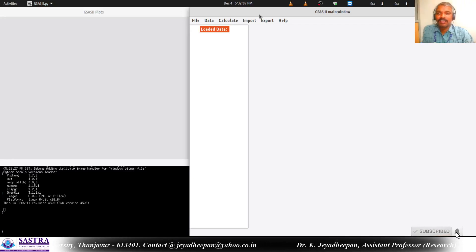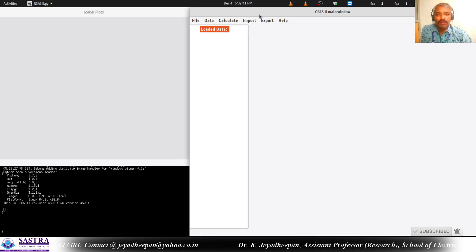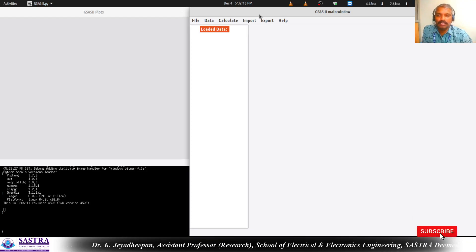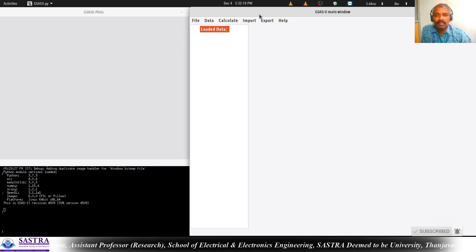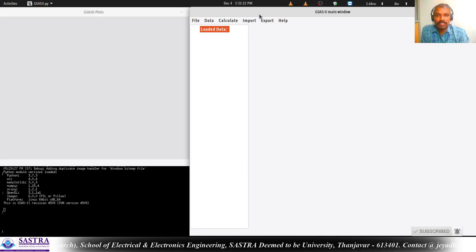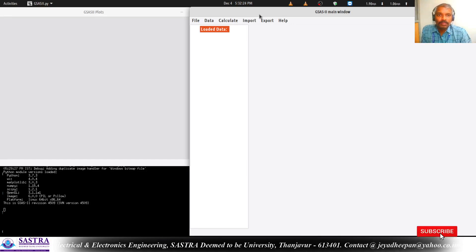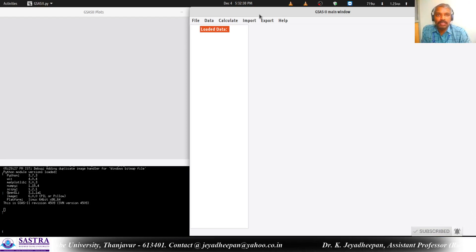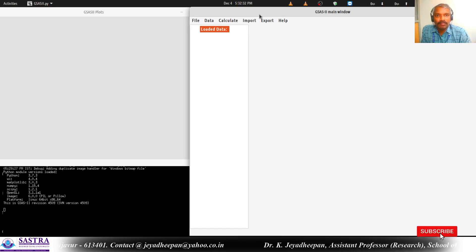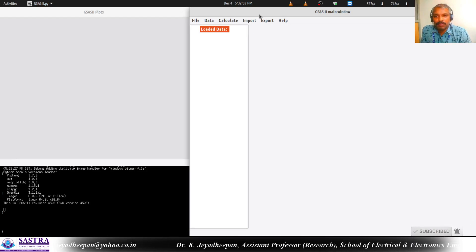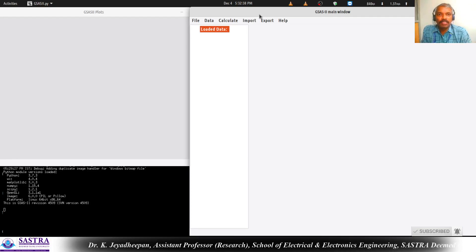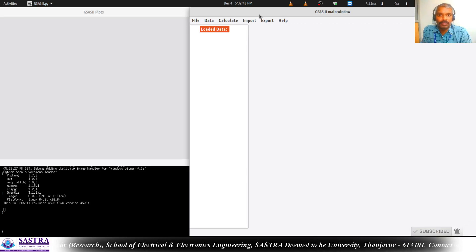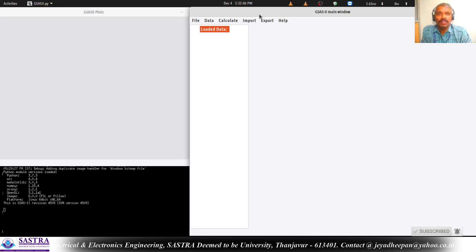Hello students and friends. In this video we are going to see a short demo on the semi-quantitative phase analysis from the X-ray diffraction data using a software called GSaaS2. Semi-quantitative phase analysis means up to the unit cell determination - starting from phase identification, unit cell parameters, space group determination, and HKL indexing. Up to this we will be calling that as semi-quantitative phase analysis.